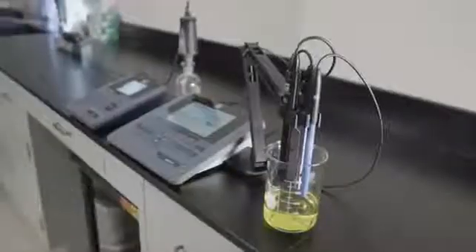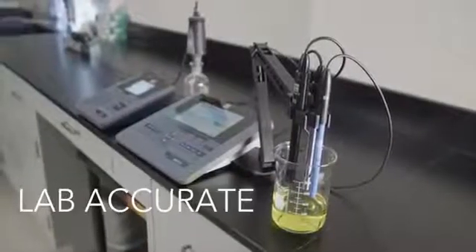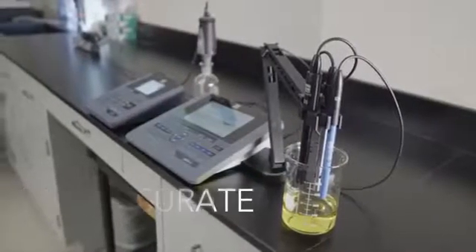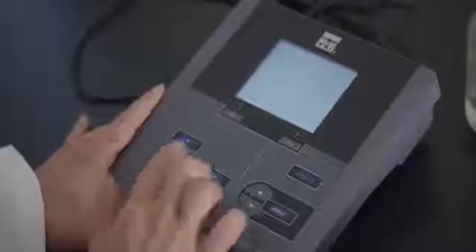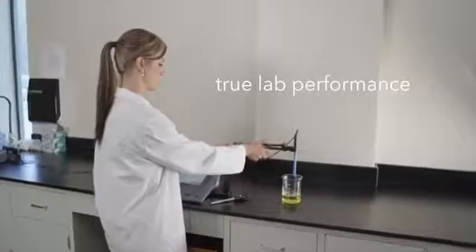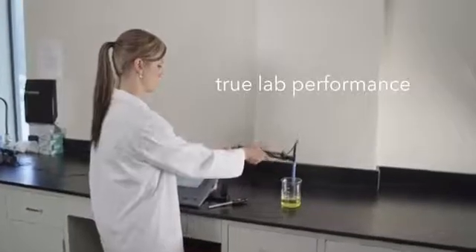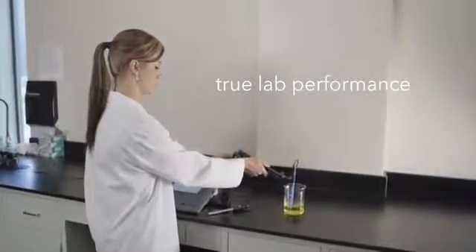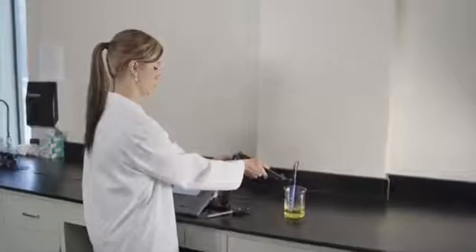The MultiLab line provides lab-accurate measurements. Whether using the 4010-1 single channel, 4010-2 dual channel, or 4010-3 three channel instrument, the highly accurate instruments will provide true lab performance.